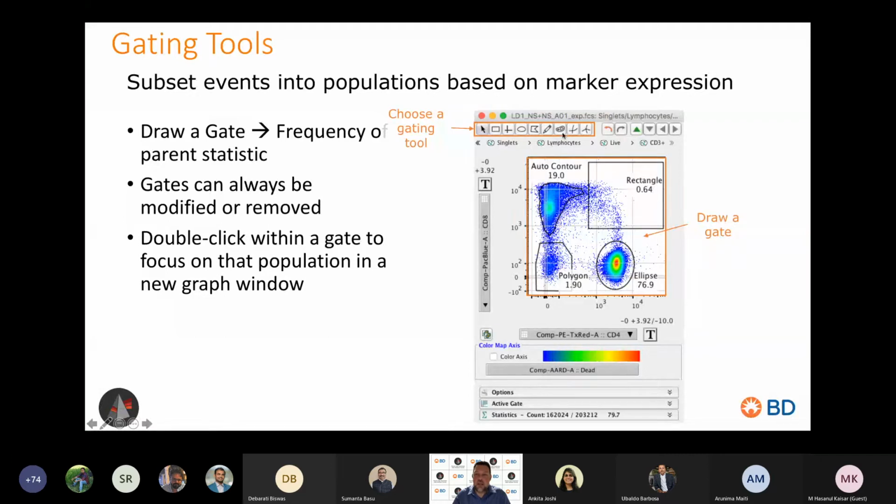And this contour auto plot tool, it'll follow the contour line of a population if you want to gate it really close, which is kind of nice. And you can move your cursor wider or closer towards the center, and it'll make the contours that gate tighter or looser around those populations. And so again, we're going to start by gating.